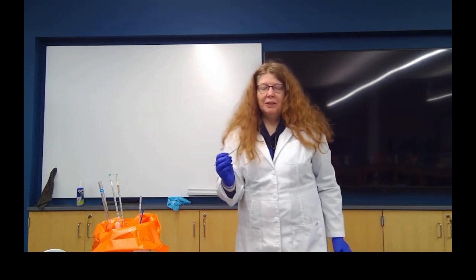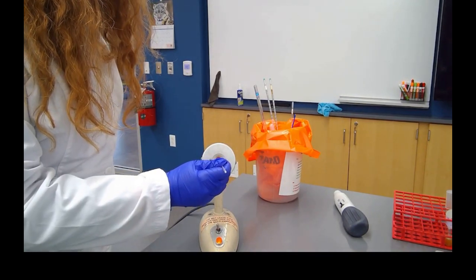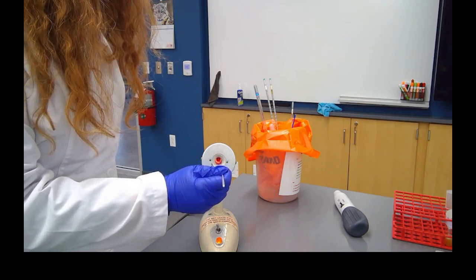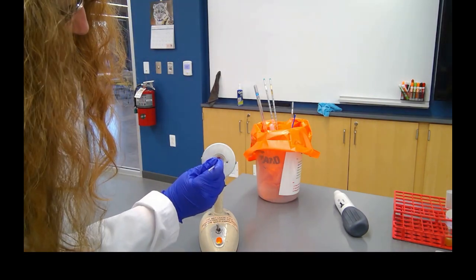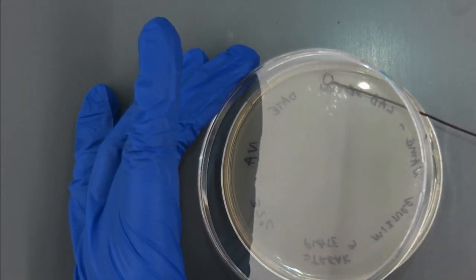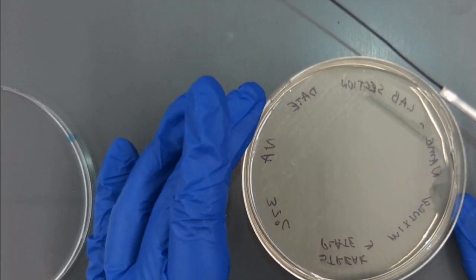I'm now going to take my loop and flame it to kill any bacteria that are on it. As you know, you insert it until it becomes red hot. And then we're going to let it cool for a little bit. If you're not sure if it's cool, one of the tips you can do is touch it to a corner of the plate, and that will cool it. If you hear a sizzle, then you know your loop is not cool yet. If I tilt the plate, I can see where my set of streaks are.